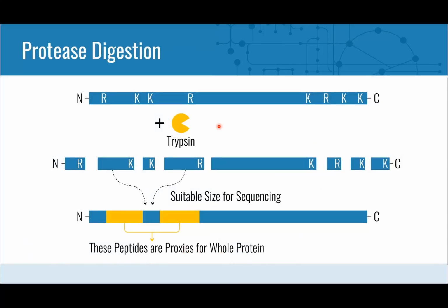Now, let's focus a bit on those peptides. If we think about how we typically do a proteomics experiment, we would use an enzyme like trypsin, which cleaves at lysines and arginines. So imagine this particular protein sequence; you would end up with peptides of various lengths. You'd have some pieces that are large, some that are small, and some in the middle. The typical ideal peptide for our mass spectrometry setup is between probably 7 or 8 and 20 residues long. Things that get much bigger or shorter than that are hard to do.